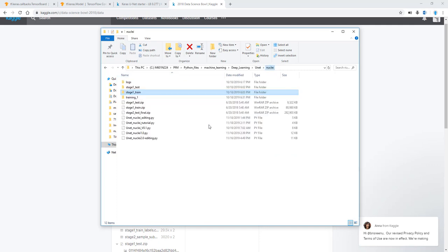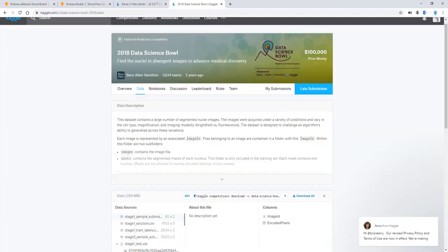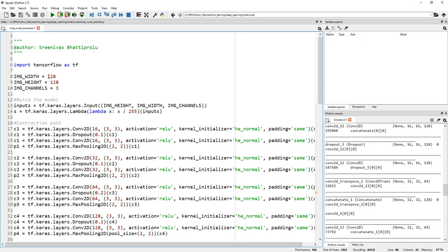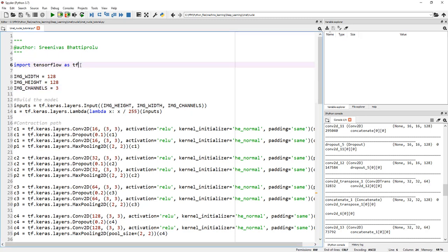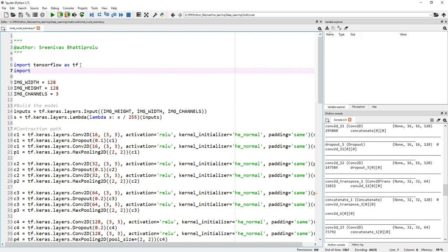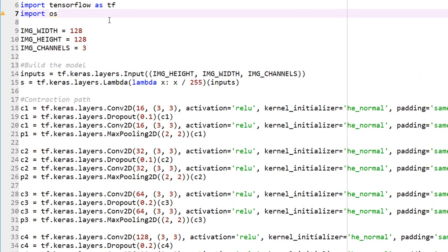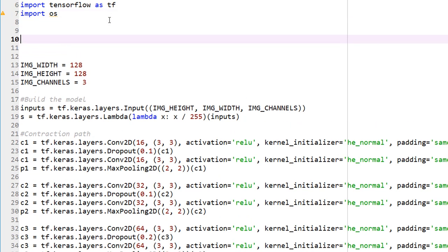Let's get back to the parent folder — we have stage 1 test and stage 1 train. Now let's get back to the code and start coding this. Our input layer takes in 128 by 128 by 3 images, so the first step is to resize all images into 128 by 128. Let's get started by adding the relevant libraries — I'm going to use OS to walk through the folders and read the file names.